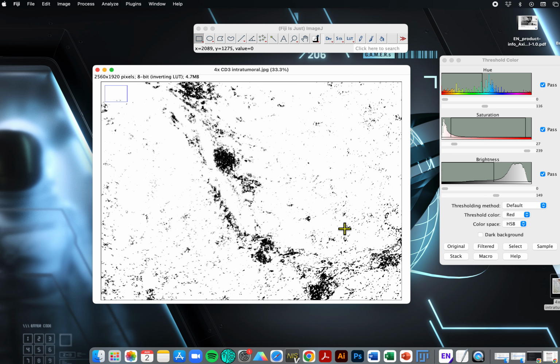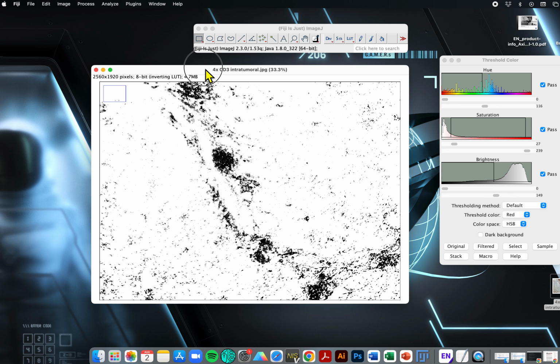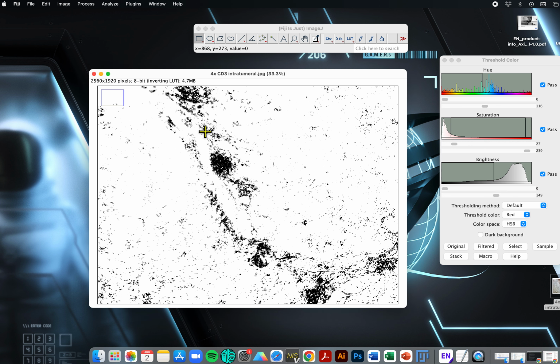And so here, what you've selected is brought forth, and everything else drops away. And that's good, that's what you want. The next thing is, ideally you really want a bit more spacing between objects, so whether it's higher magnification or maybe not as strong of a stain, that's usually ideal for counting.